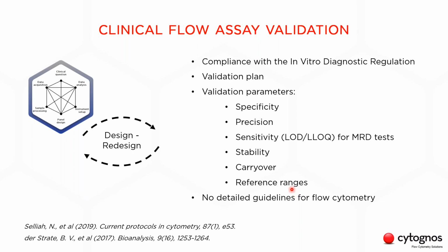So for that, we need to assess several parameters like the specificity, precision, sensitivity, which is essential for minimal residual disease tests, stability, carryover, and even establishing reference ranges. But what happens at this moment? That there are no specific guidelines for validating flow cytometry tests in regulated environments.